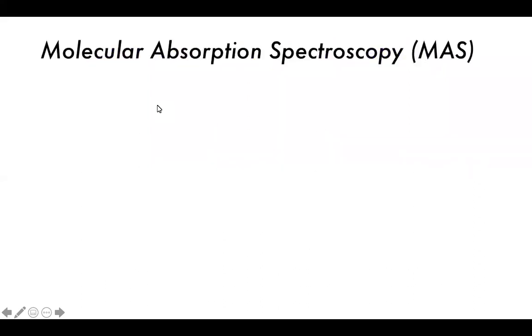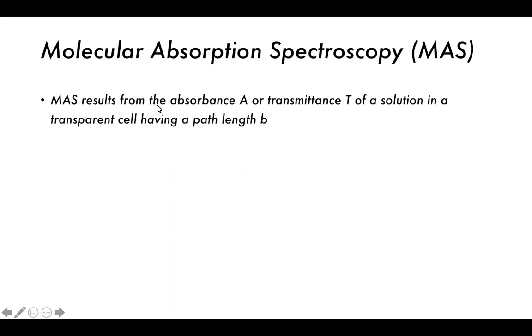So it's still ultimately based on this idea that we had in the UV-vis spectroscopy, where there's some sort of absorption going on. The absorption in this case is going to be the absorption of energy in a vibrational or rotational state. So we're going to talk about what vibrations are, but basically they're the movement of two atoms which are close together, two atoms which in chemistry we say are bonded together.